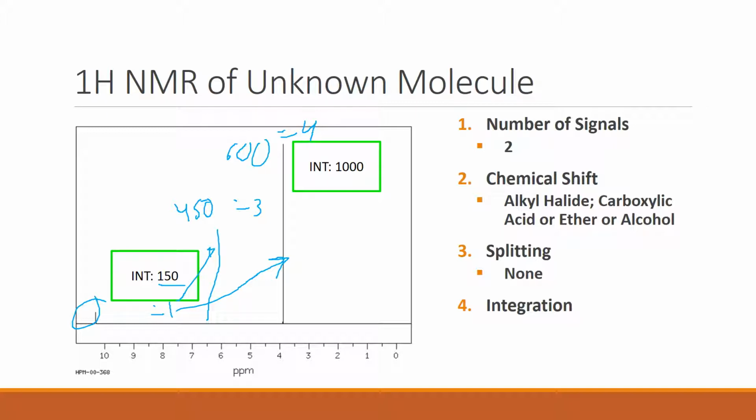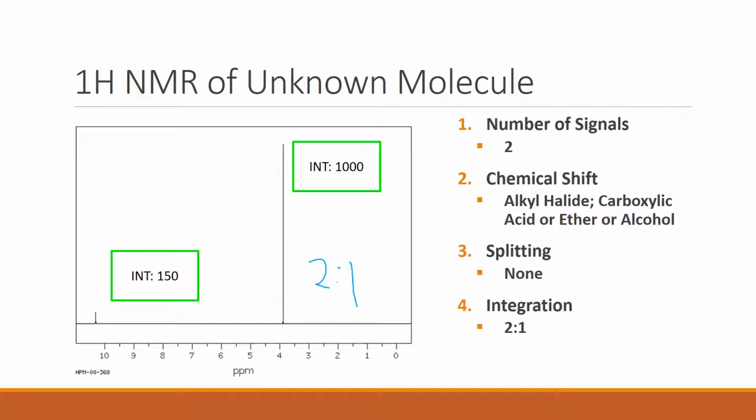But here, it may be based on the hydrogen bonding with the carboxylic acid. I'm not sure why SDBS gave such a high value for this, but it certainly is not, let's see, 700, about a 7-to-1 ratio, which would be projected by this, as 1,000 is the max value that you can get. Okay, so in reality, we're going to find it's going to be more of a 2-to-1 ratio between our hydrogens in each environment.